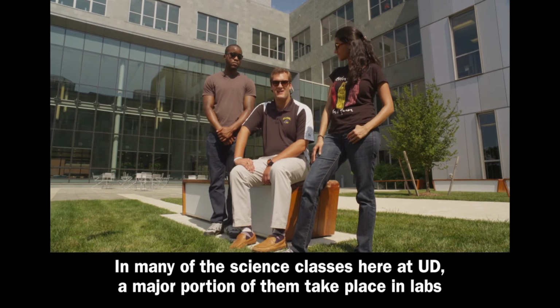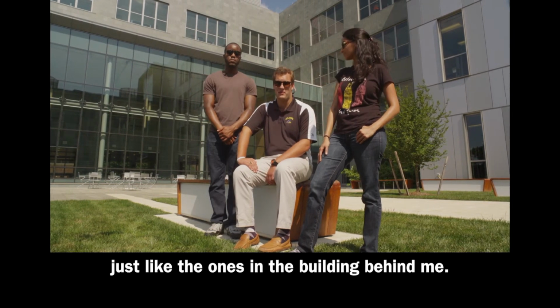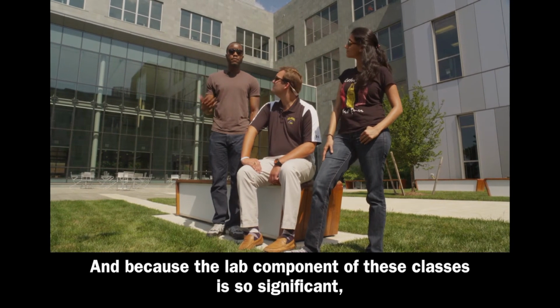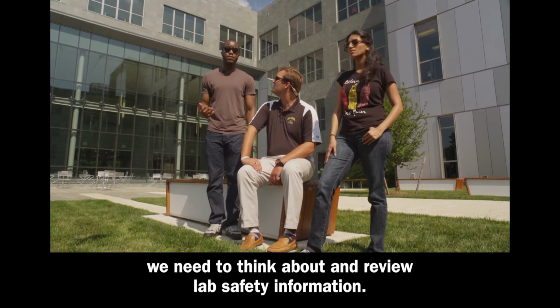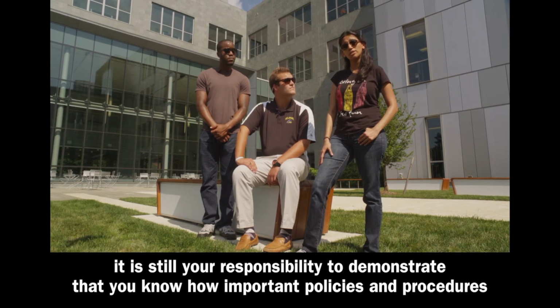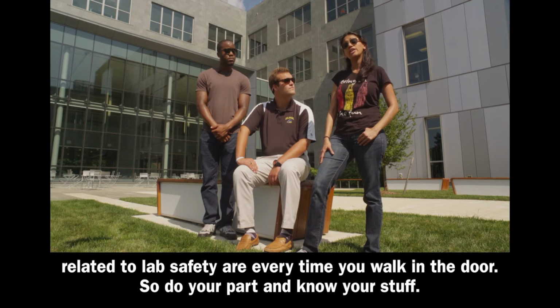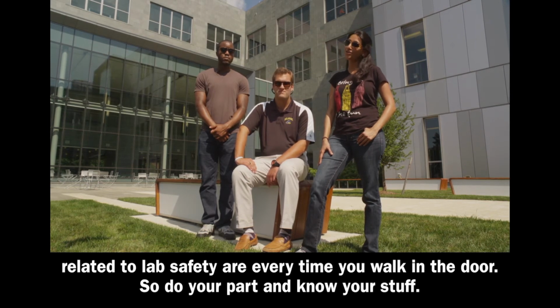In many of the science classes here at UD, a major portion of them take place in labs, just like the ones in the building behind me. And because the lab component of these classes is so significant, we need to think about and review lab safety information. And even though you have taken numerous lab classes in the past, it is still your responsibility to demonstrate that you know how important policies and procedures related to lab safety are every time you walk in the door. So do your part and know your stuff.